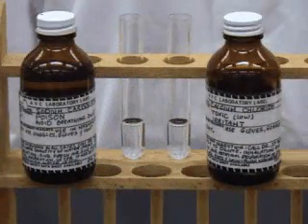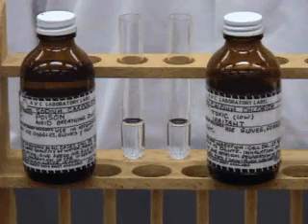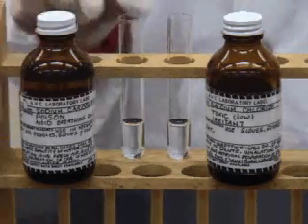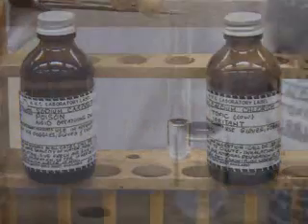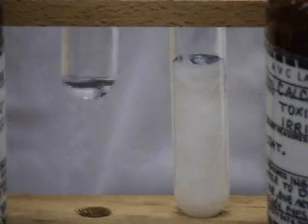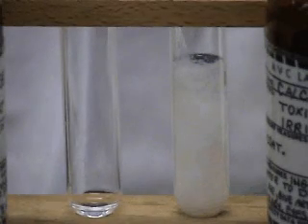Record your initial observations for sodium carbonate solution on the left and calcium chloride solution on the right. We'll now mix those solutions. Record this observation.